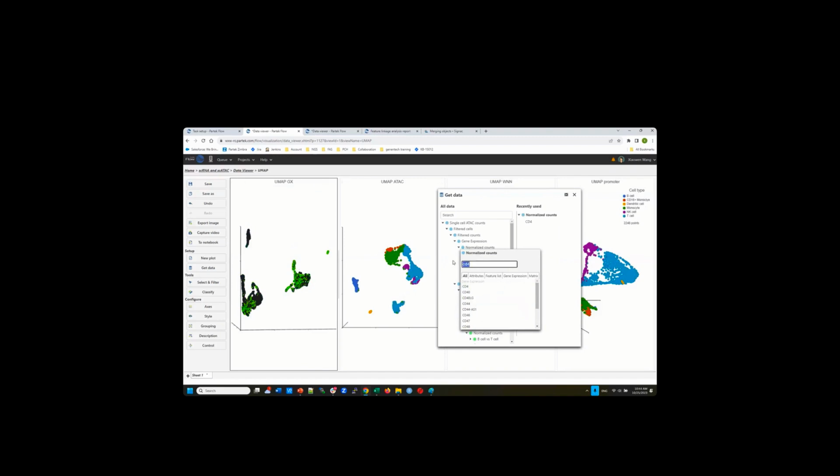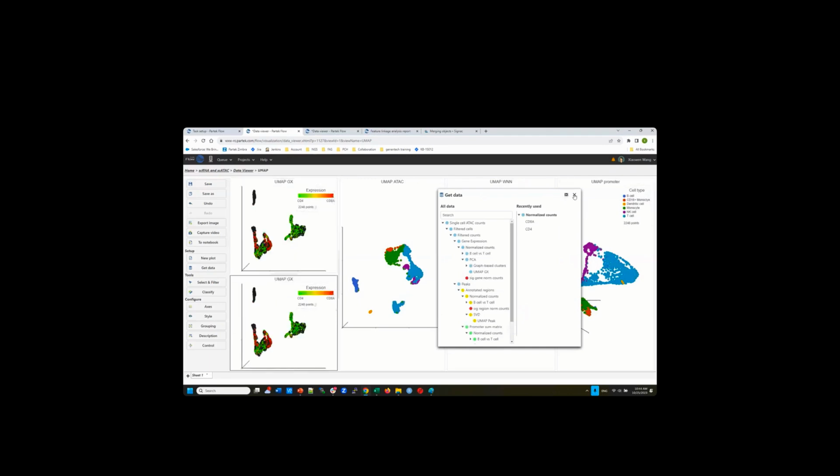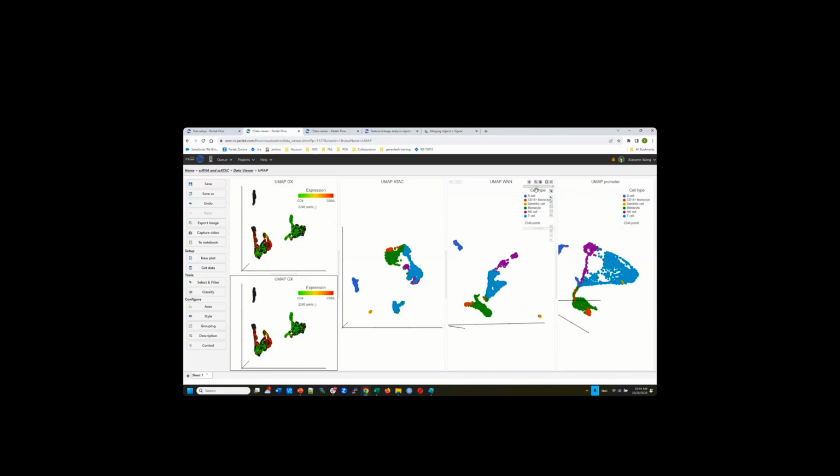And then if I go to CD8, CD8A, oh, wait, hold on. I forgot what my setup is. I'm going to duplicate that and use this as cell type. Oh, this is T cell, sorry.